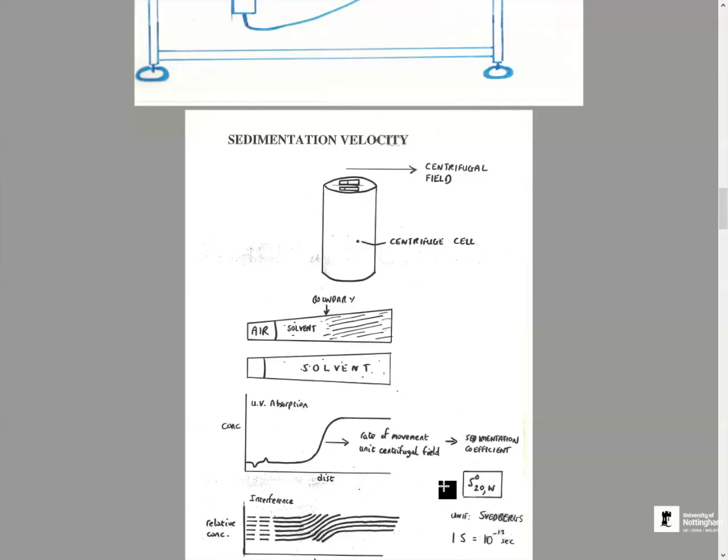And what we also commonly do is, because the sedimentation coefficient will depend on what solvent you're using, if it's water or phosphate buffer or whatever, it'll go much faster than if it's going through a glycerol solution or syrupy solution. Because of the high viscosity, it will slow the sedimentation down.